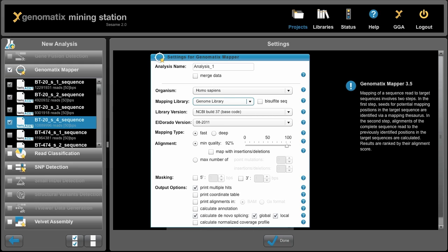And now we simply have to tell the mapper that this is bisulfite sequencing data. And then the mapper will consider the CT conversion during the mapping. Now we can set different parameters, and we can click on Done to start the mapping.